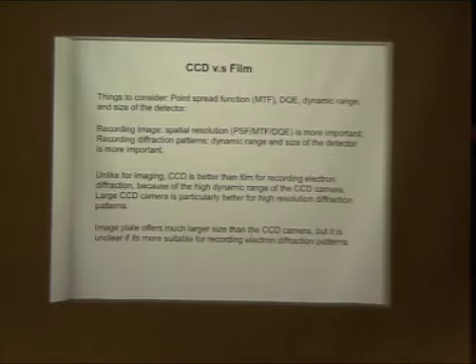We didn't use the best imaging plate scanner, and we didn't use the best CCD camera. But what we found was that even though we don't need the beam stop, we can't measure the low resolution spots, simply because the inelastic scattering background is so anisotropic that we can't correct for it. So whether you have a beam stop or not, you can't measure the low resolution spots. Another problem with imaging plates is that the information dissipates, so we kept the imaging plates in the microscope and scanned them the next day. But that wasn't a problem, that was still very good.